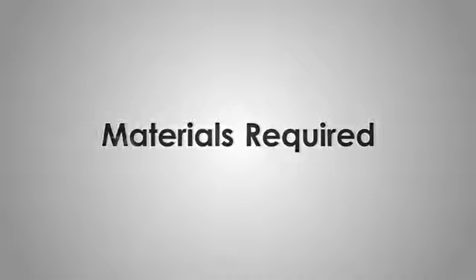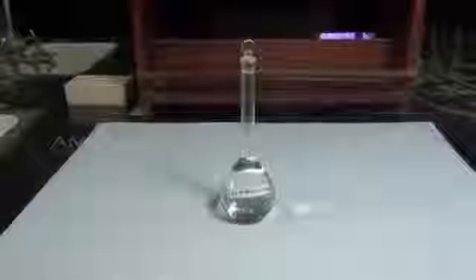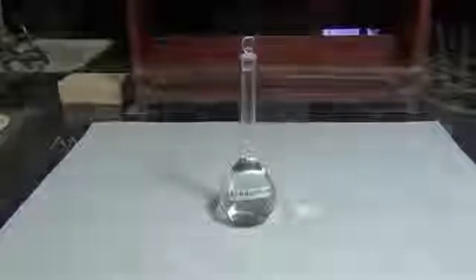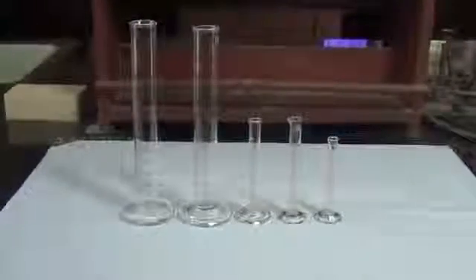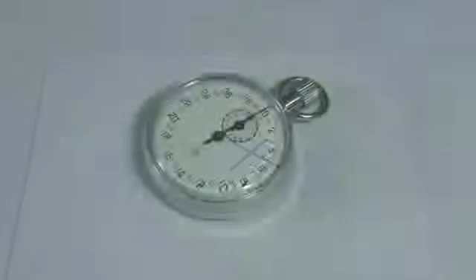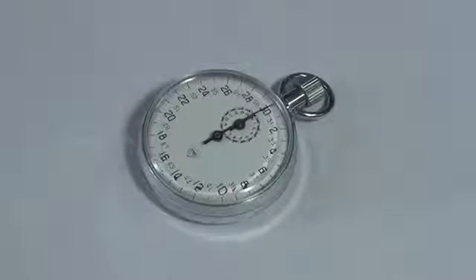Materials required: 0.1 molar sodium thiosulphate solution, 1 molar hydrochloric acid, distilled water, conical flasks, measuring jar, tile with a cross mark, stopwatch, etc.